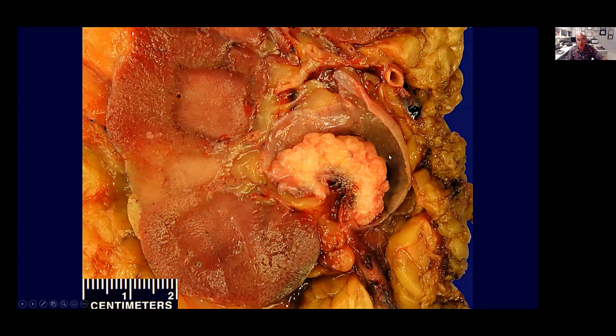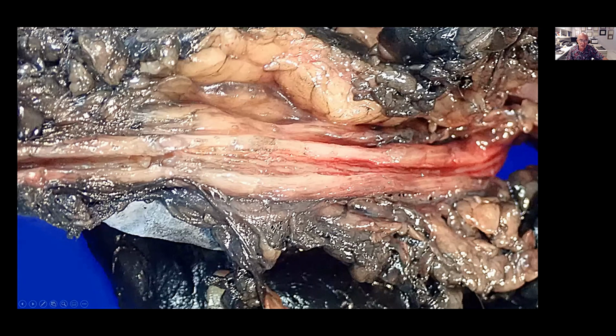Here is another tumor that is also very papillary, present in the pelvis, but it appears to go into the fat. So this tumor went beyond the muscle invasion and now is involving the perirenal fat or the sinus fat, and good samples of this area need to be taken. And all these specific samples of the tumor are going to depend on the location. And never forget the ureter.